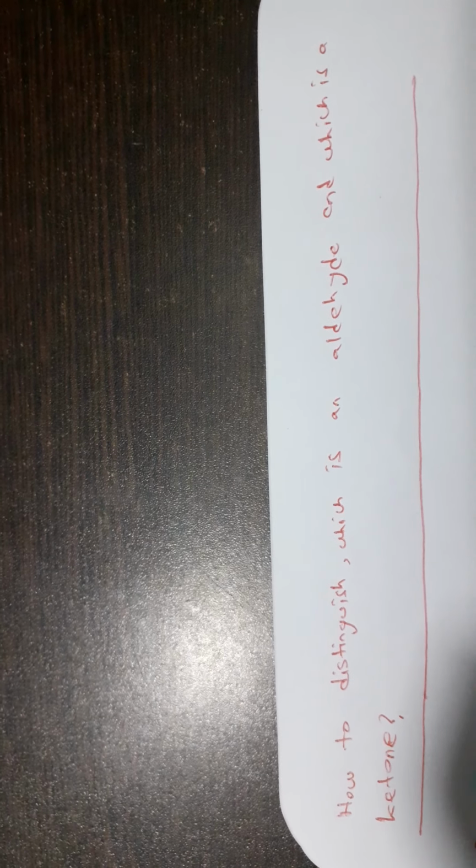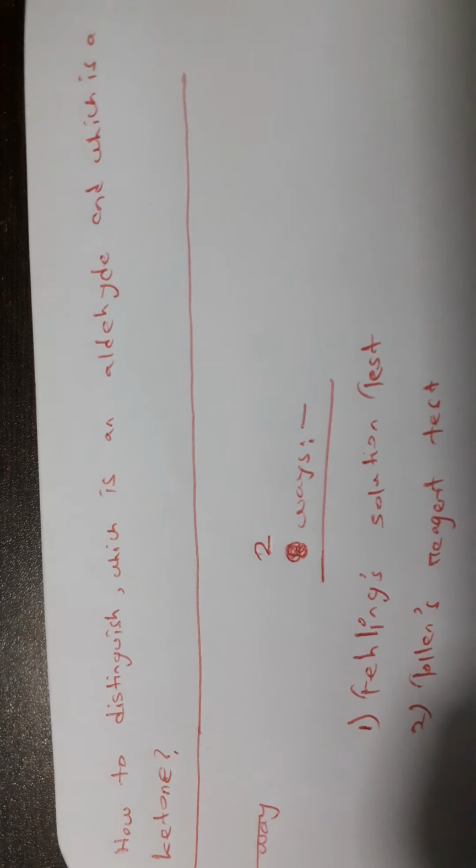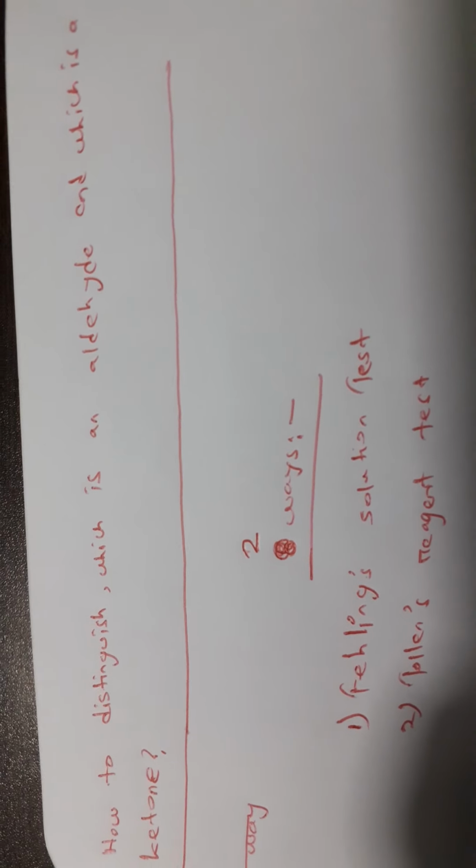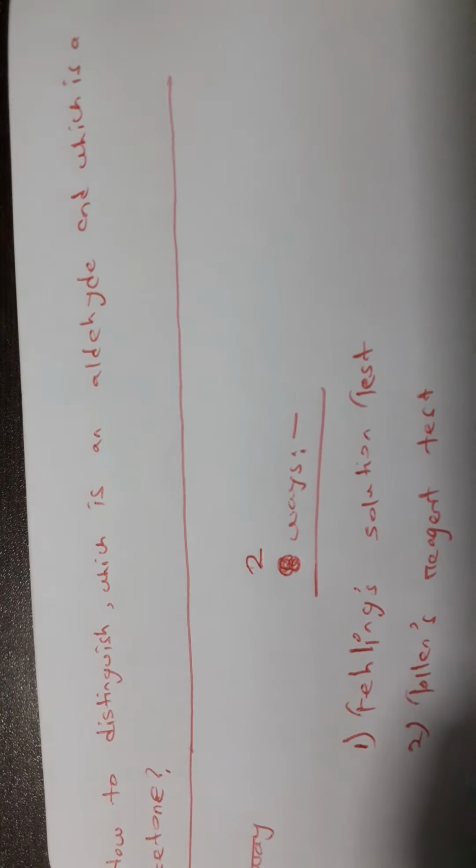Hello guys, today we are going to learn some ways in which we can differentiate or distinguish which is an aldehyde and which is a ketone. Now there are two ways of doing this. Number one, the Fehling solution test, and number two, the Tollen's reagent test.